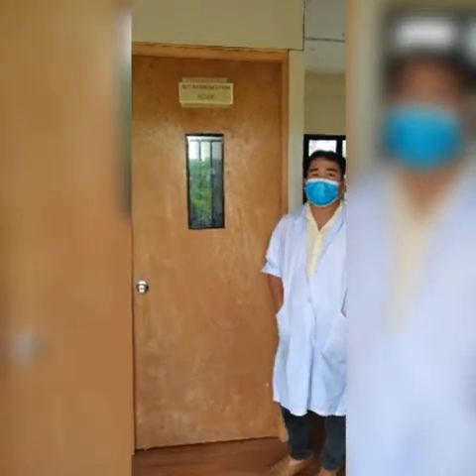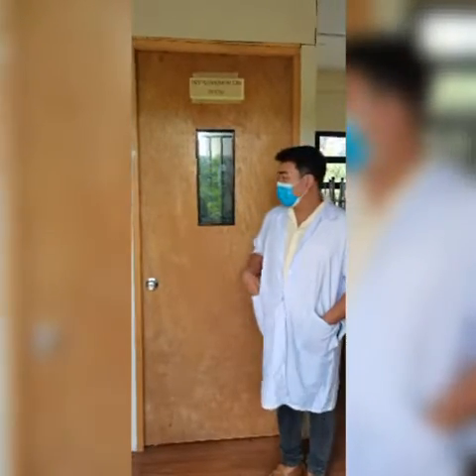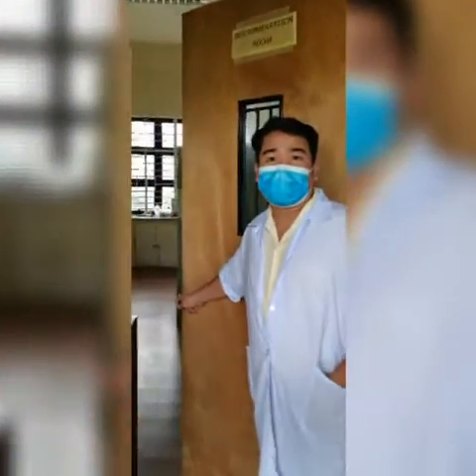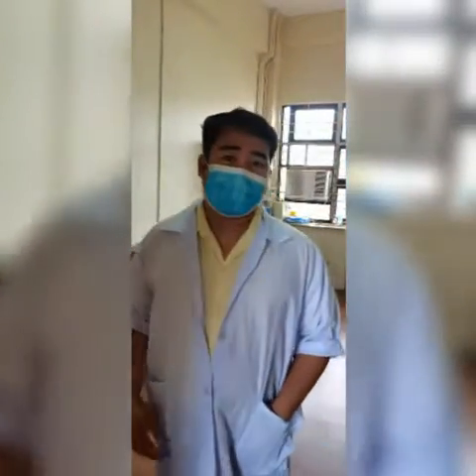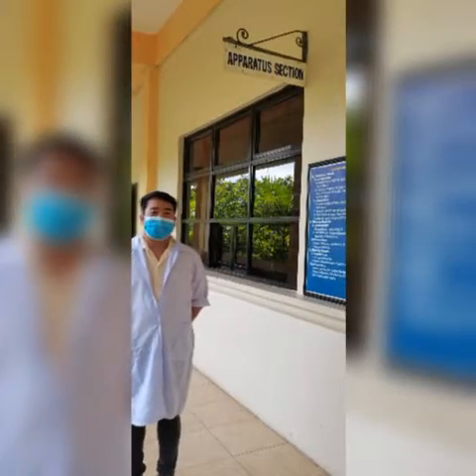The instrumentation room is one of the sections of the Central Science Laboratory. Here inside, you can find the weighing scales or the digital balances used to weigh different chemicals and substances. This area is equipped with air conditioning to maintain the stability, the operation, and the functioning of the different delicate equipment and devices.